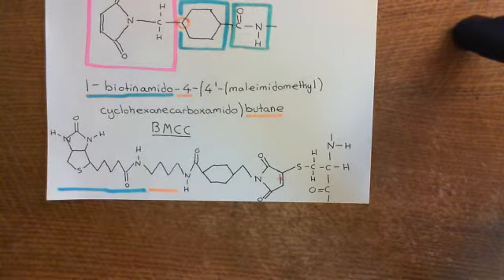In the one with hydroxylamine, the hydroxylamine molecules cleaved the palmitoyl groups off of cysteine residues, and this meant that you then had free cysteine residues on these proteins once again, which were the cysteine residues originally bound to palmitic acid molecules.